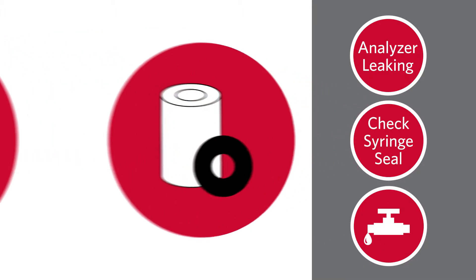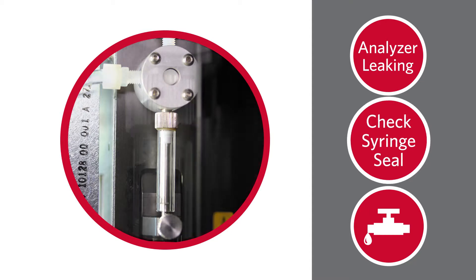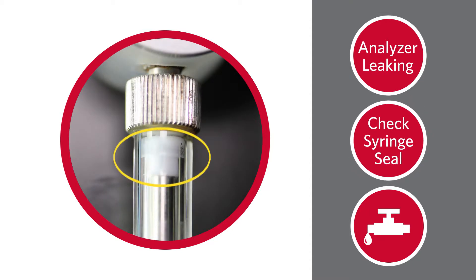If the syringe seal is leaking, you will need to replace the seal. Click here for further instructions on syringe seal replacement.